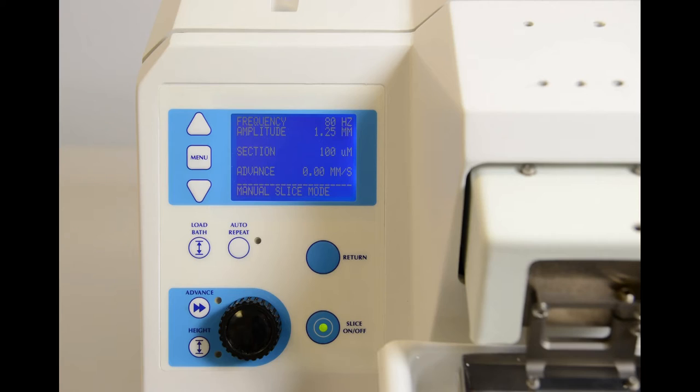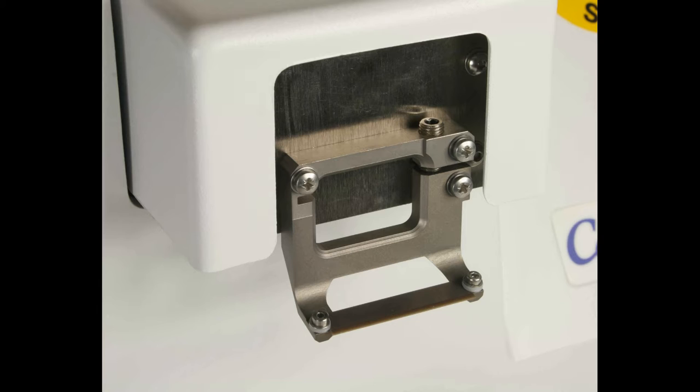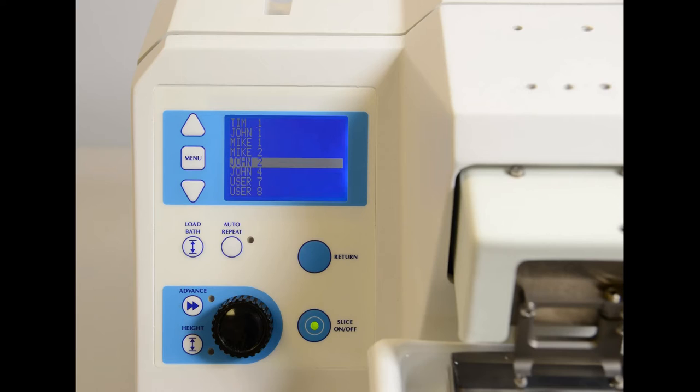The horizontal vibratory amplitude can be adjusted between 0.5 and 2.5 millimeters with a vibration frequency between 50 and 120 hertz. The instrument has a vertical Z-axis deflection error of less than 1 micron. The blade advance speed is variable up to 4 millimeters per second.